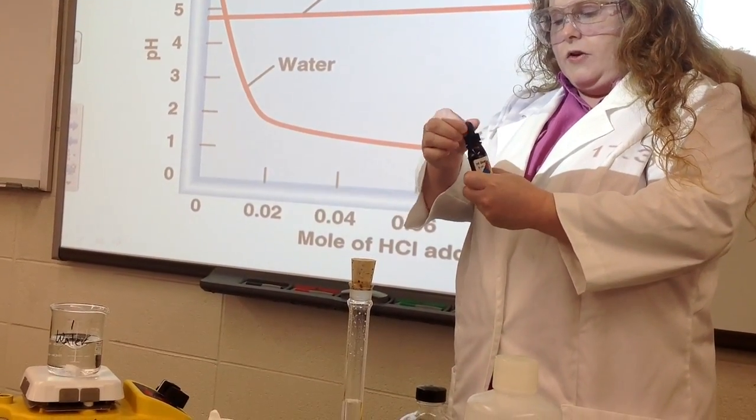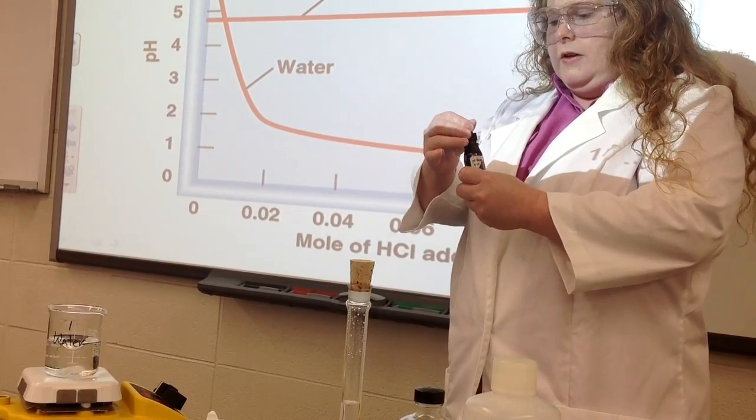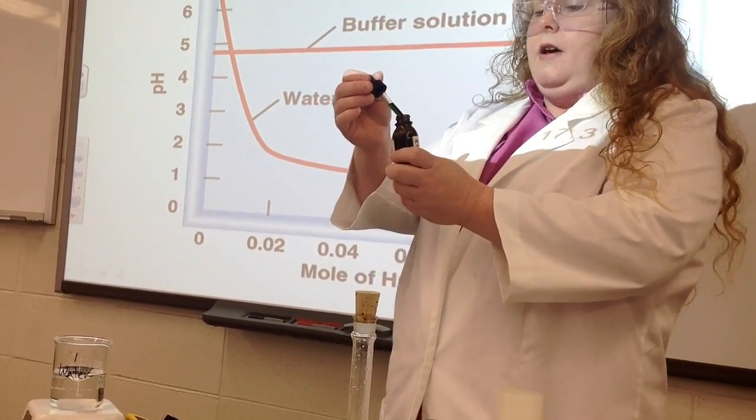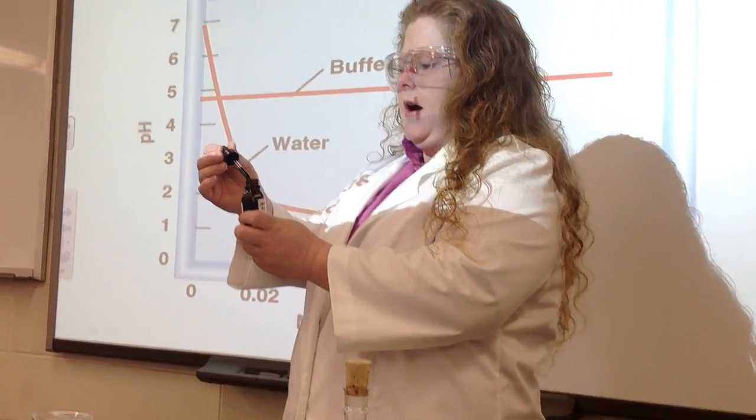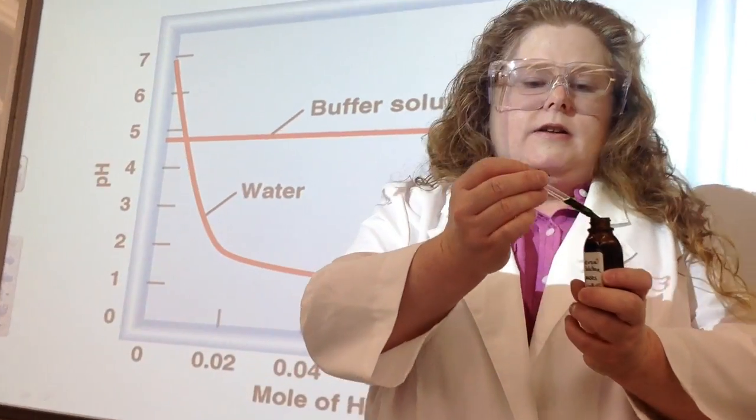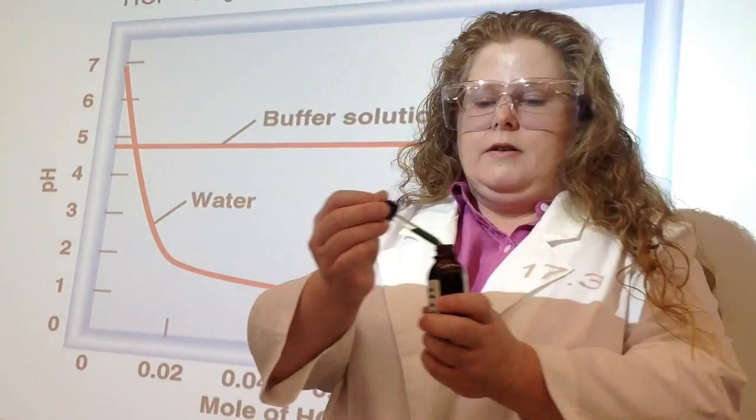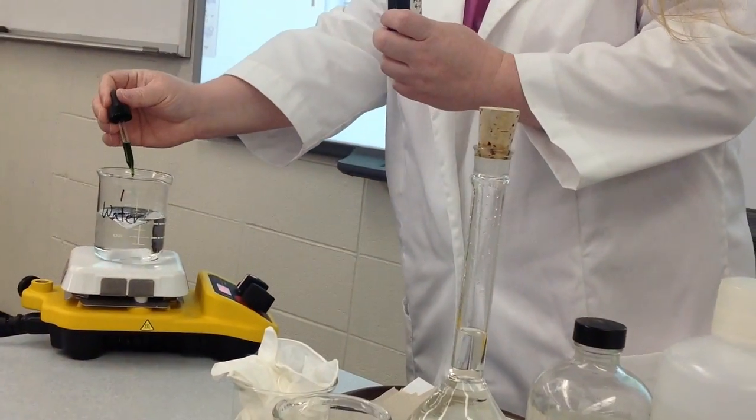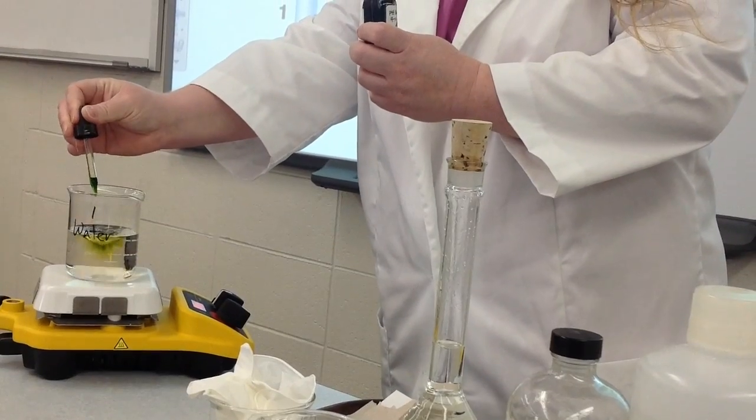This is a Fisher universal indicator. The indicator itself might be hard to see in the back, but to start out it's actually a green color. Now I'm going to put this into the water and put quite a bit.